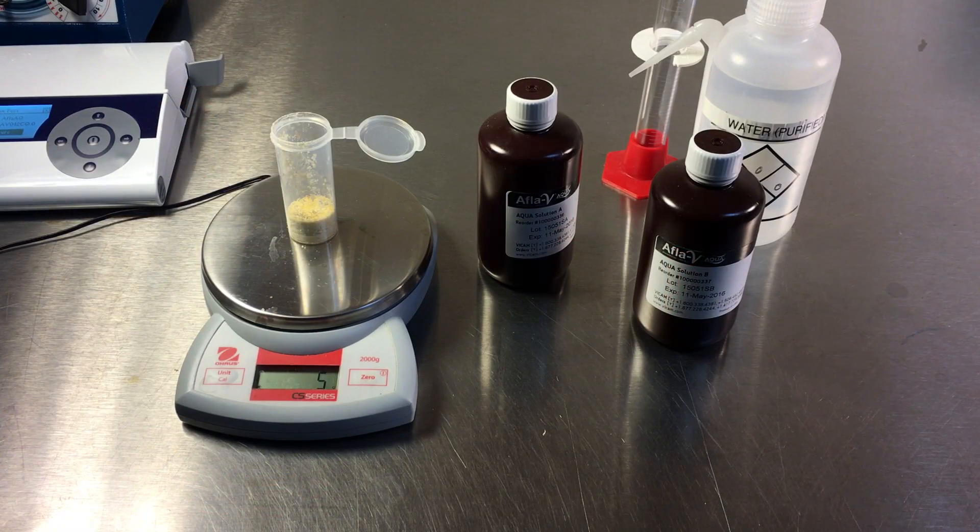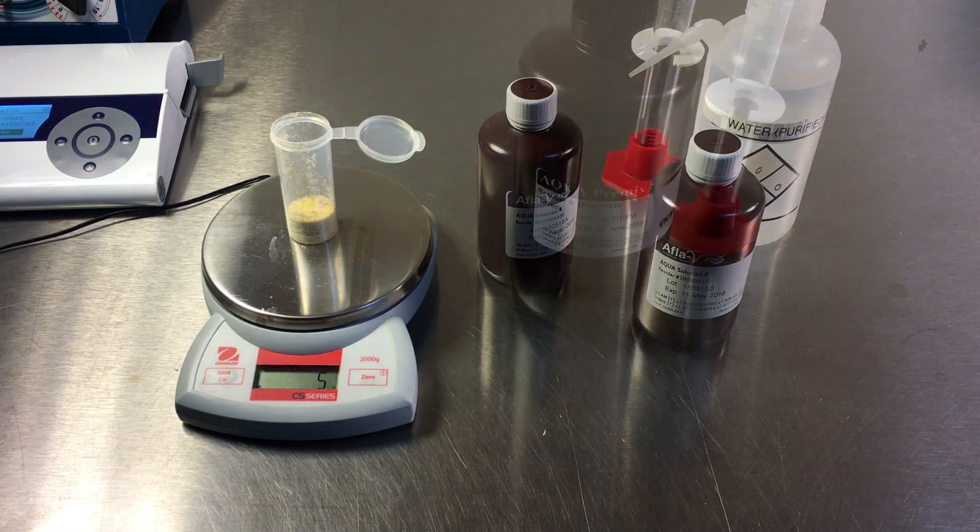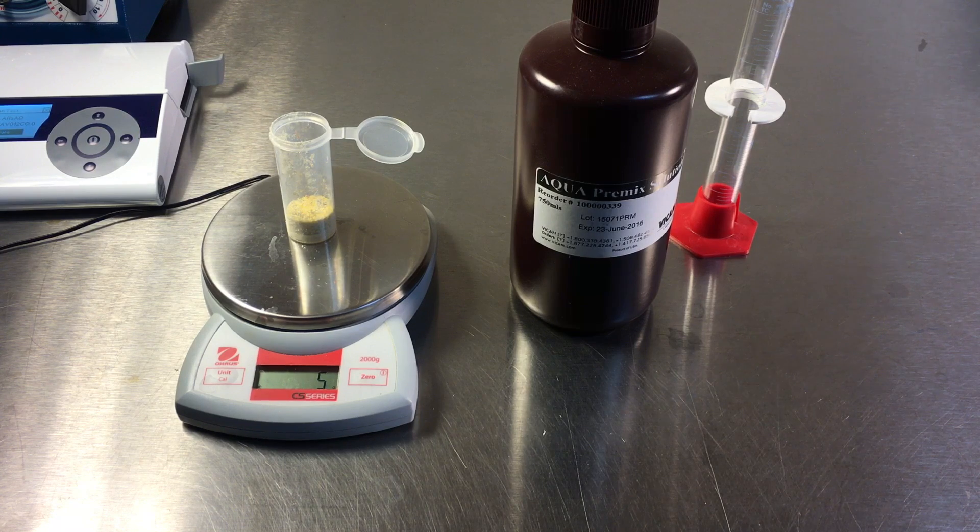The AFLA-V Aqua Test requires purified water, aqua solution parts A and B, and AFLA-V diluent solution. To remove a step, you may alternatively use aqua premix solution from Vicam.